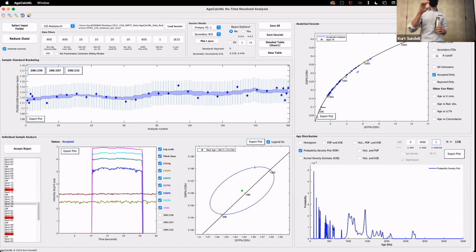So if you save that session and then 5 years later, you're like, what filters did I use? You could load that back up or open it up in MATLAB by its root source. There's a lot of ways to get the filters back out. It's a way to just keep track of what you actually did, because I know I can't remember things that are going to happen today by tomorrow.